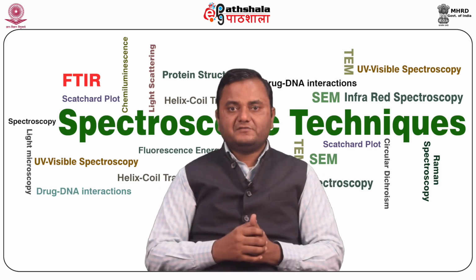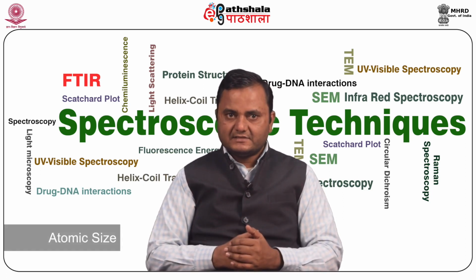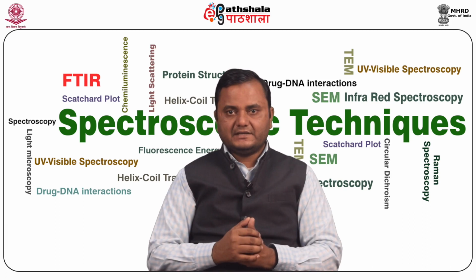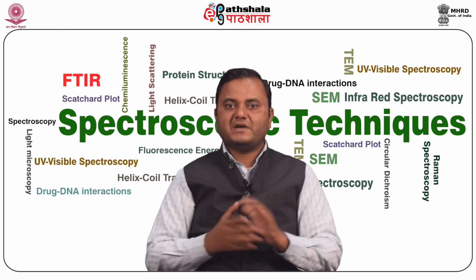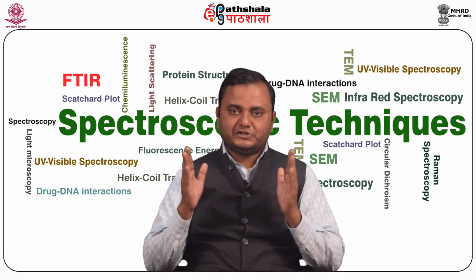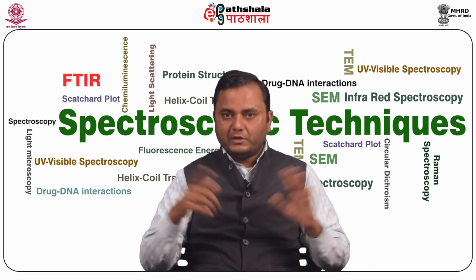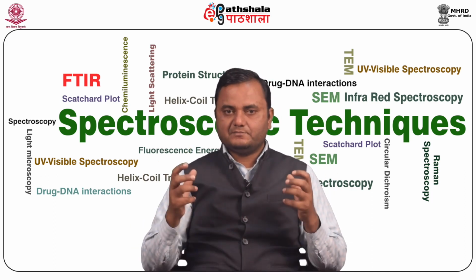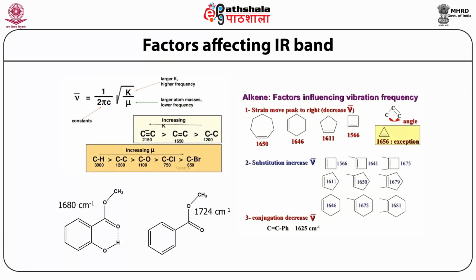So the position of the spectral band depends on the bond strength and atomic size, and the intensity of the peak results from the efficiency of the coupling. For example, a vibration that has a large change in the dipole moment creates a larger electric field with which photons can couple more efficiently, and thus produces more intense bands in the IR region. We discussed the factors affecting the IR bands. It is a very important slide.